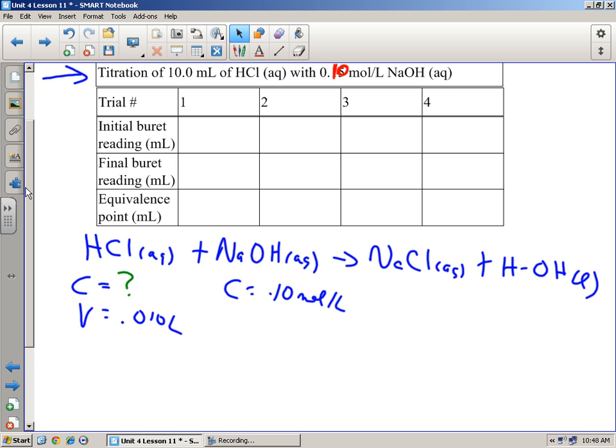Okay? Now if I put the acid up here, the base is going down there. If I put the base up here, the acid goes down there. We have to mix the two together. We're going to do that by running solution through here and catching it in the bottom and making those two solutions react together. Okay? Good so far? Now, what do we want to put where? Well, does it matter? Well, it does, kind of.